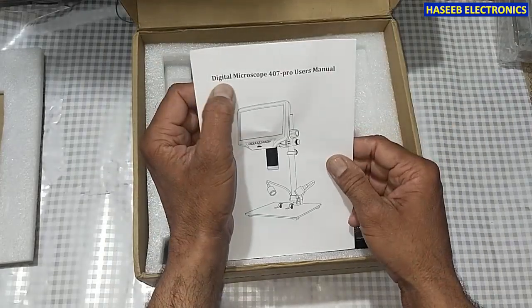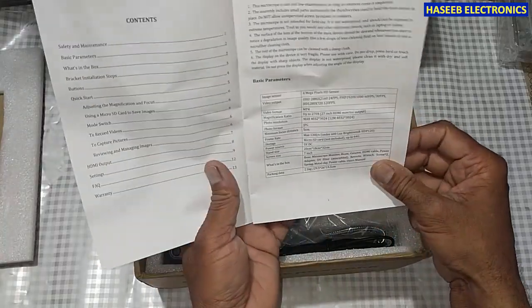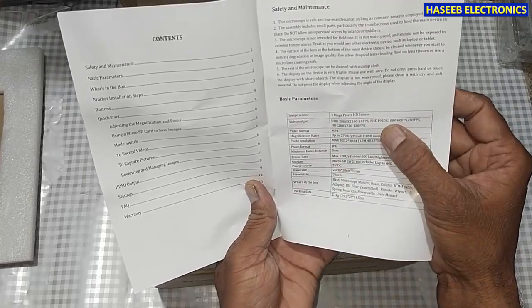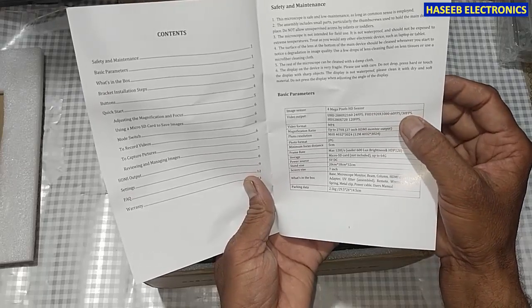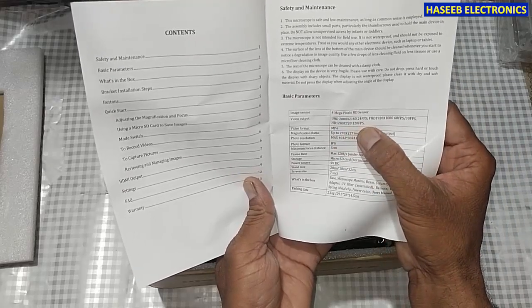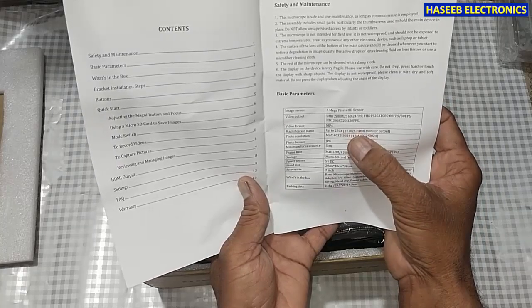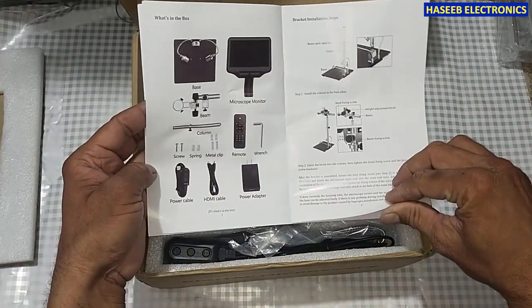It has a digital microscope 407 professional user manual. Its basic parameters include video output UHD and 1920x1080 full HD at 60 frames per second and 30 fps. There is also HD 1280x720 at 120 fps, and the video format is MP4. Magnification is up to 270 times.